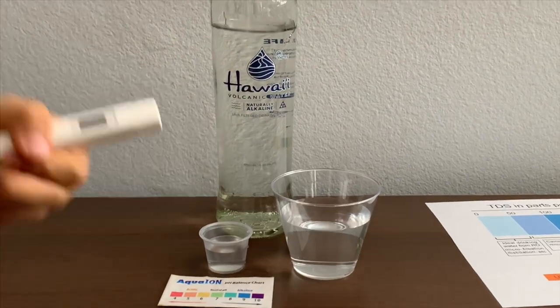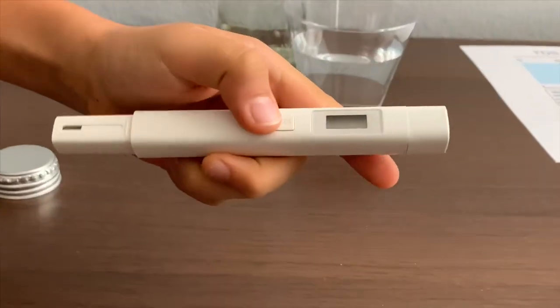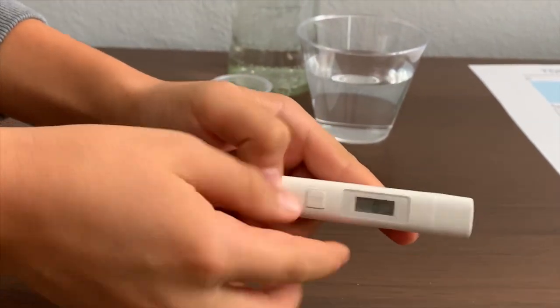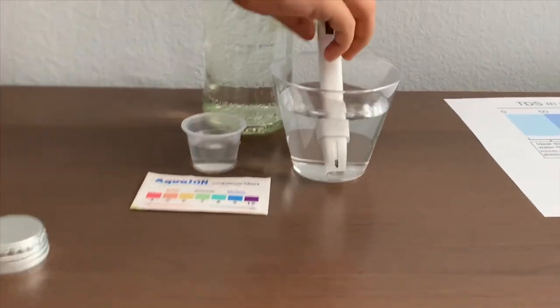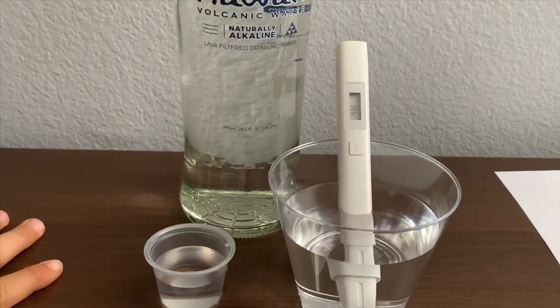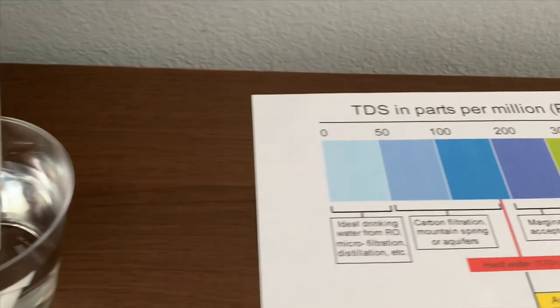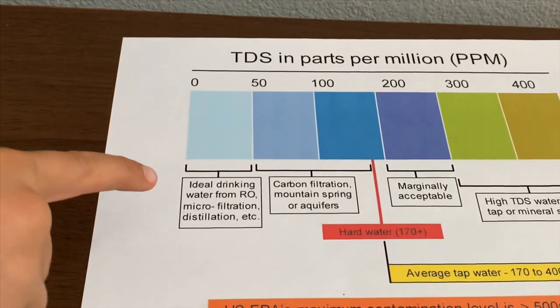If you want to buy this TDS tester, check the link down below. Turn on the TDS tester, make sure it says zero, and put it in. That is ideal drinking water.